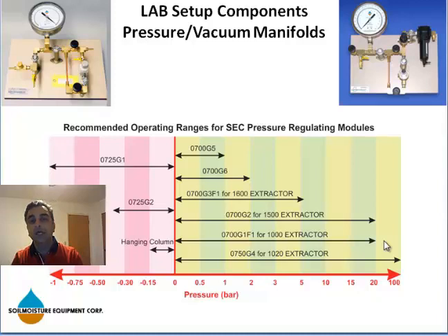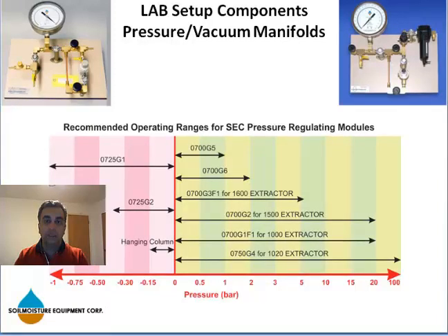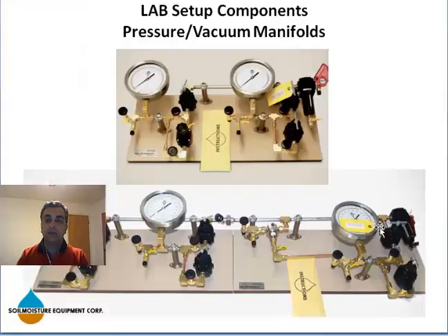If you are buying a complete system, then good for you. You don't need to add these numbers, although getting familiar with different components, of course, always puts you in a better position. All right, let's go and take a look at some other slides. I added these pictures just to show you that you can order combo manifolds.